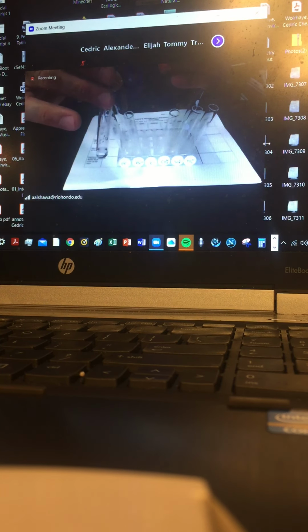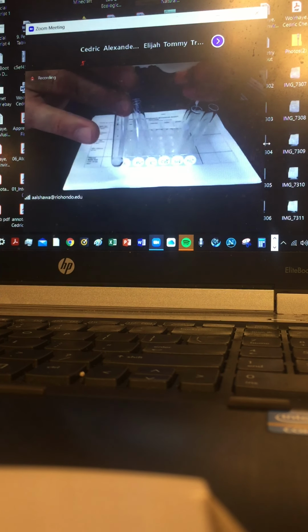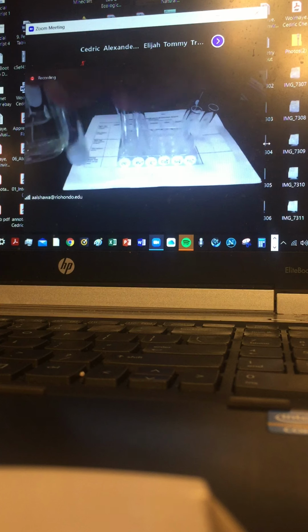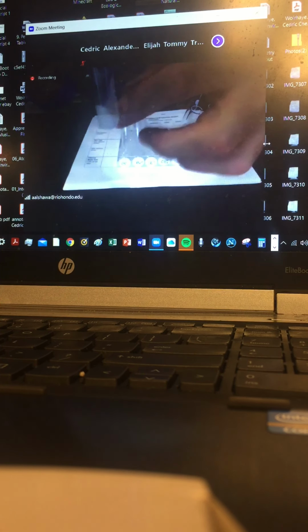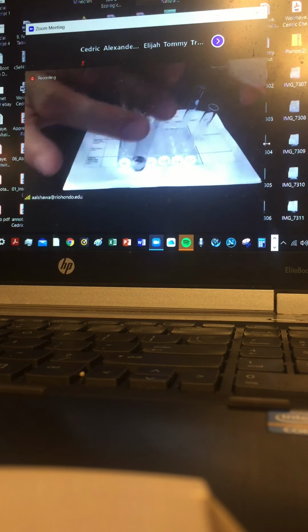So I got carbonate with the chloride. Notice what happened. This is the carbonate that used to be clear. That's the carbonate, and that's the carbonate upon addition of barium chloride. That means barium carbonate is formed. That's a solid.